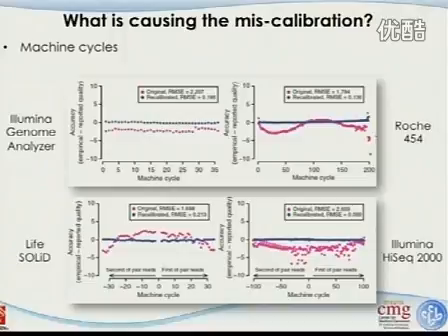You can see that Illumina really is lying all across the board. Regardless of whether it's the beginning of the read, which is the first cycle, or the end of the read, the reported accuracy is pretty bad. It's really in the negative category. And for the 454, it comes to this type of really bizarre shape. And for SOLiD, so SOLiD is stupid. This is the evidence for that, right?